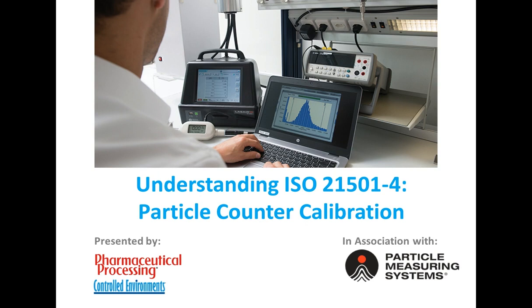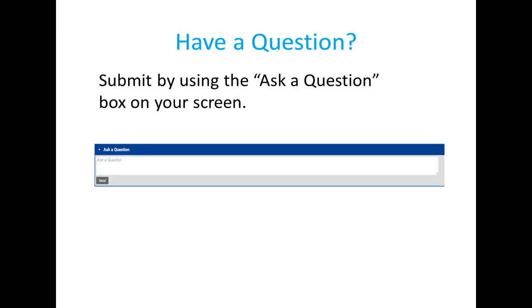By the end of this webinar, you should have a good understanding of the following concepts and how they affect your cleanroom particle counting efforts: how to be compliant with the most recent calibration requirements, sampling flow rate, counting efficiency, particle counter resolution, pulse height analyzer, false count rate, particle size setting, coincidence loss at maximum particle concentration, and maximum particle number concentration.